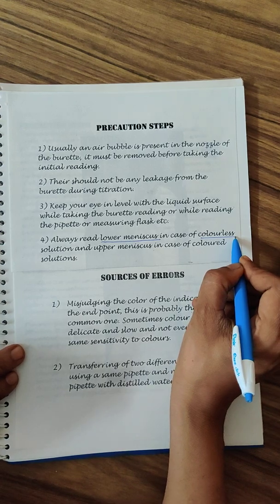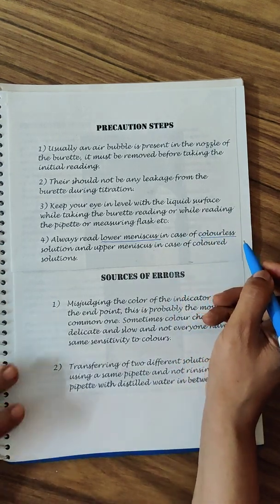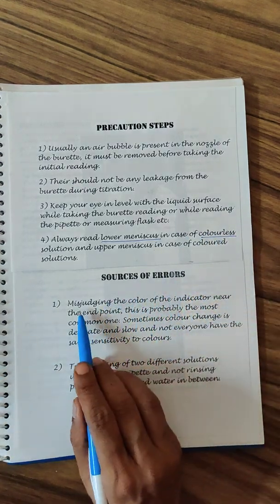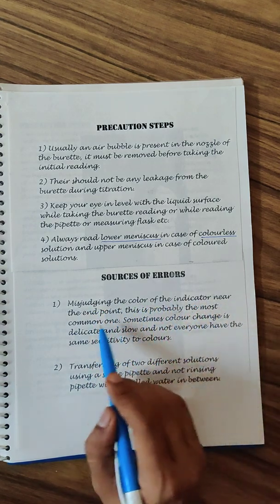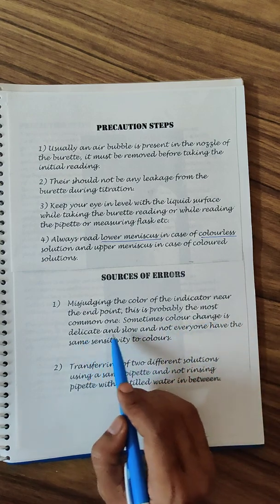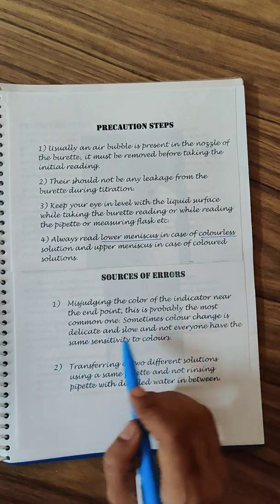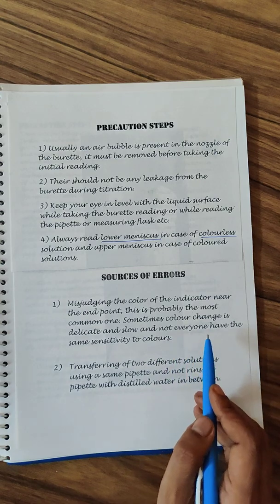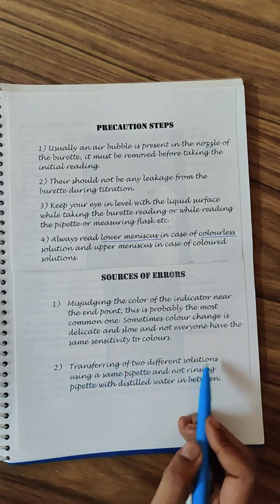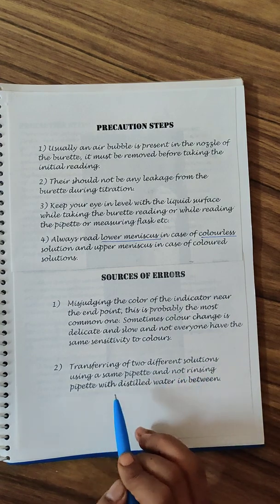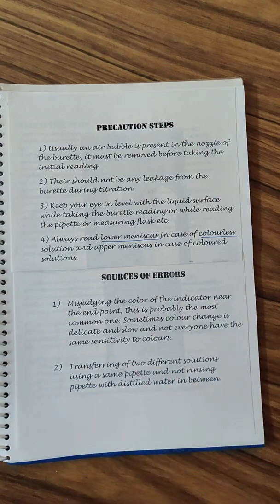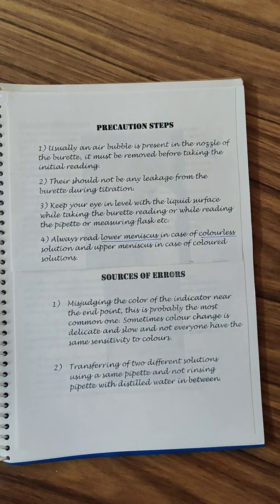Sources of error could be misjudging the color of the indicator near the endpoint. This is probably the most common error. Sometimes color change is delicate and slow and not everyone has the same sensitivity to the colors. Transferring the two different solutions using the same pipette and not rinsing the pipette with distilled water in between is also a problem which is commonly observed.